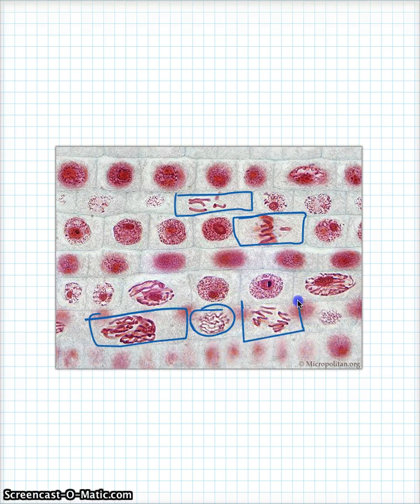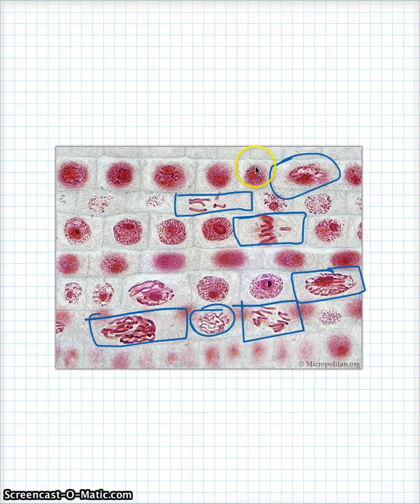What about this? Anaphase. See the little Vs? Prophase here. And then, this is probably prophase.